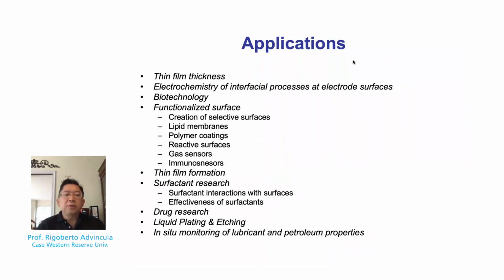Drug research could refer to investigation of drug kinetics, pharmacokinetics, liquid plating, and etching processes that occur with the bulk media, let's say for a deposition of metals or removal of material, and in situ monitoring of lubrication or petroleum properties on surfaces, including anti-scaling and anti-corrosion phenomena.